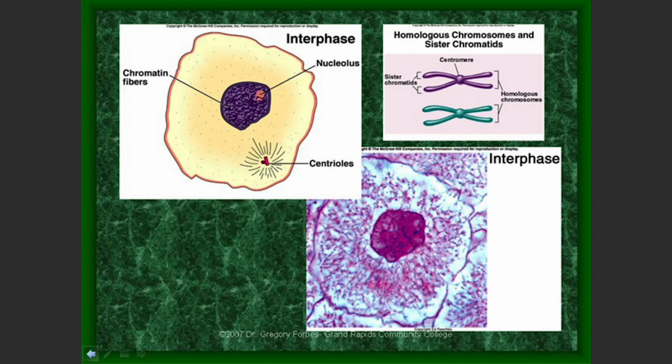And so we're going to take a look at how the characteristics of the cell change between these different stages. Now when we look at interphase, remember this is actually the phase just before mitosis begins, how do we identify when a cell is in interphase? Well, first of all, this purple area represents the nuclear membrane. The brown or pink, whatever color that is, area here represents the cellular membrane.